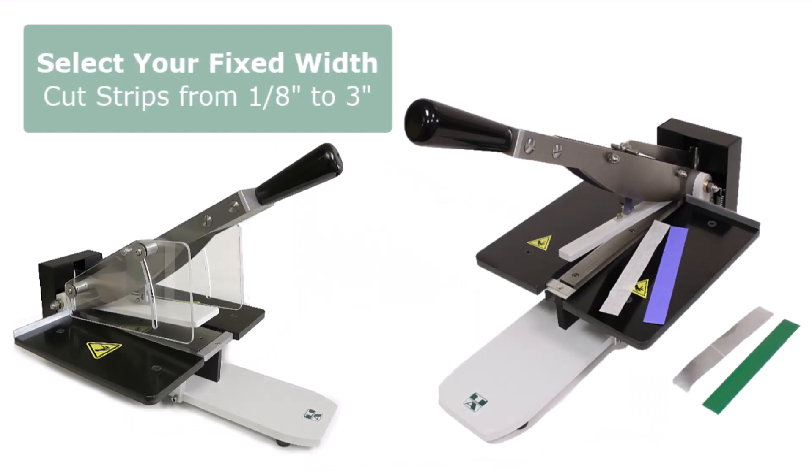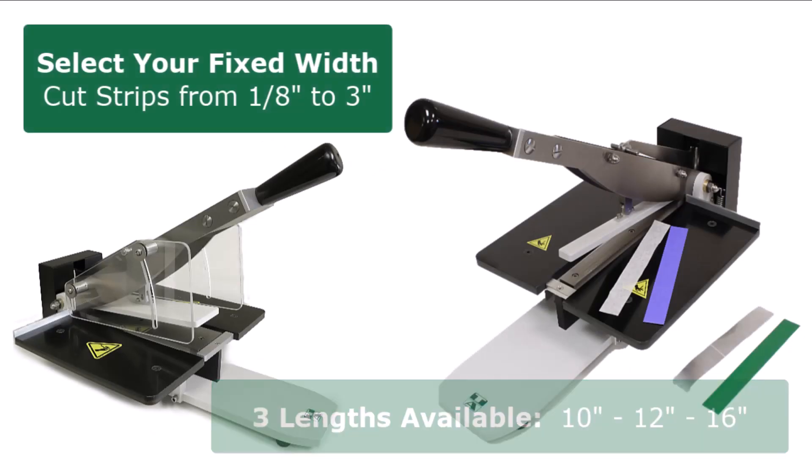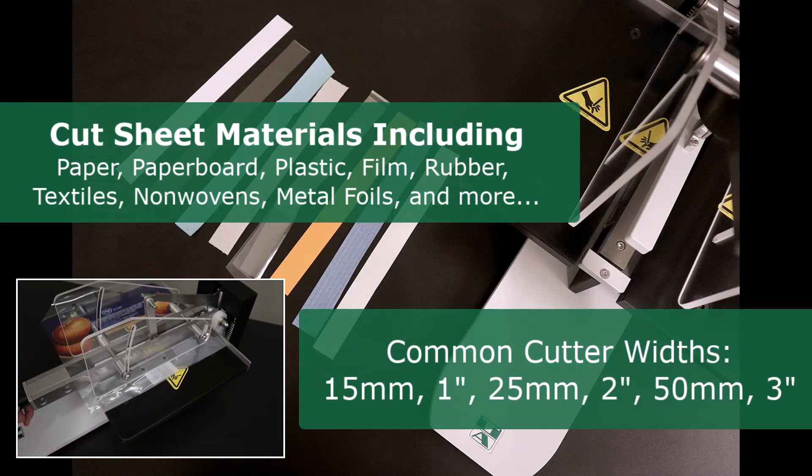You select the fixed width and length of your cutter. Choose 10 inch, 12 inch, or 16 inch lengths. Common cutting widths include 1 inch, 25 millimeter, and 3 inch wide samples.